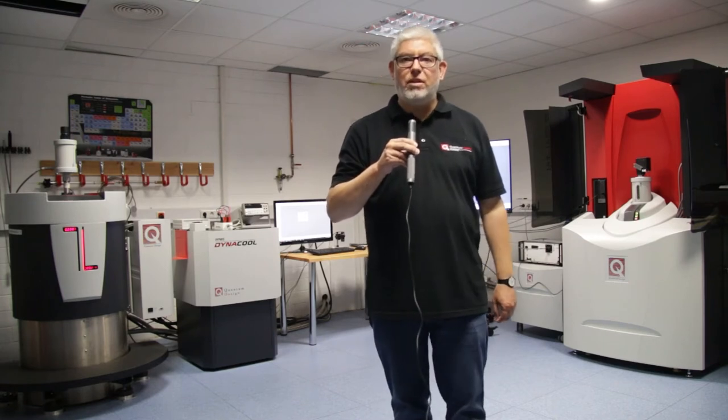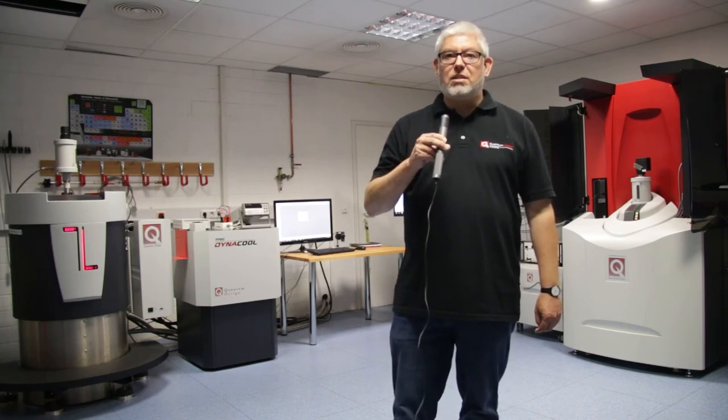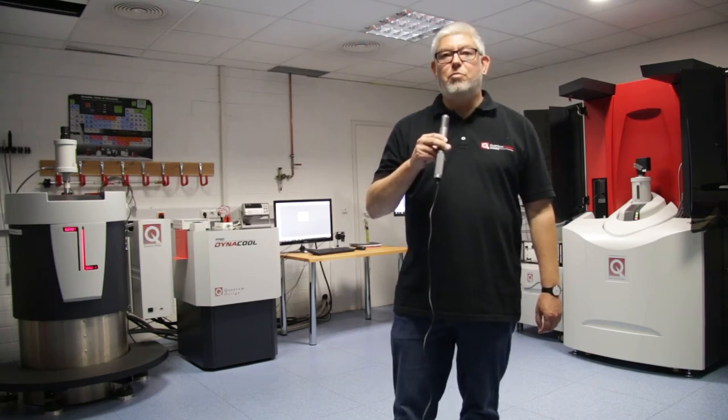VSM — vibrating sample magnetometer — was invented by Simon Foner in the late 1950s. It combines the speed of a sinusoidal sample movement with lock-in analysis technology.